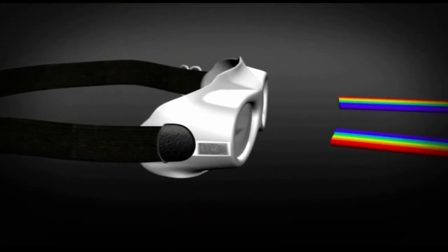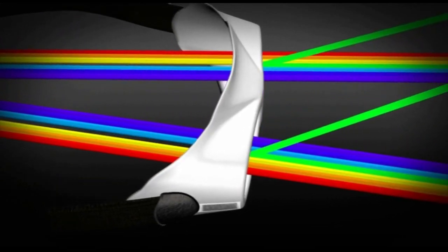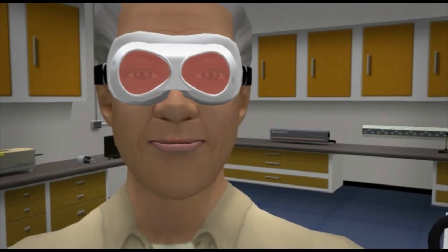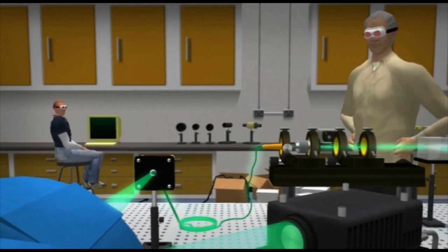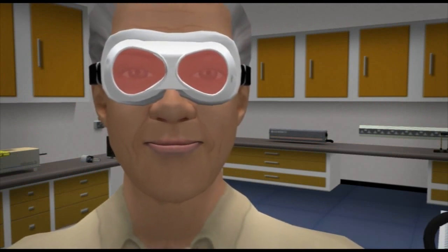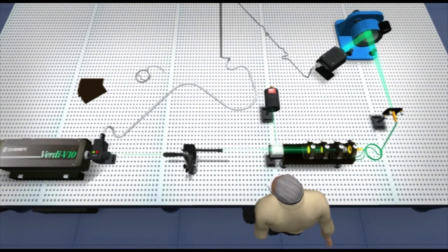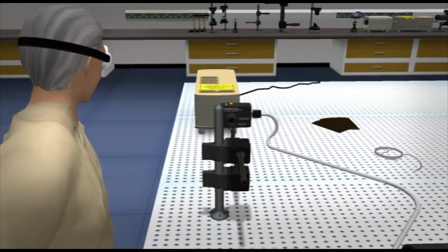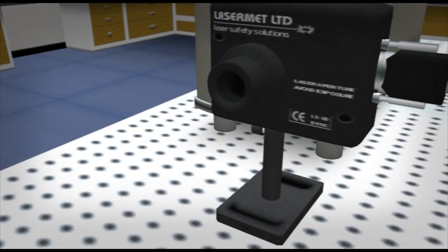Coated filters, instead of absorbing, reflect the specified wavelengths of the laser. As a result, there is the potential for these types of filters to produce unintentional reflections. So it is important that other people in the lab are also wearing eye protection. These filters can have an angular dependence, which should be described in the manufacturer's literature. Some pulsed infrared lasers can cause particularly severe injuries if suitable eyewear isn't used with an unenclosed beam.